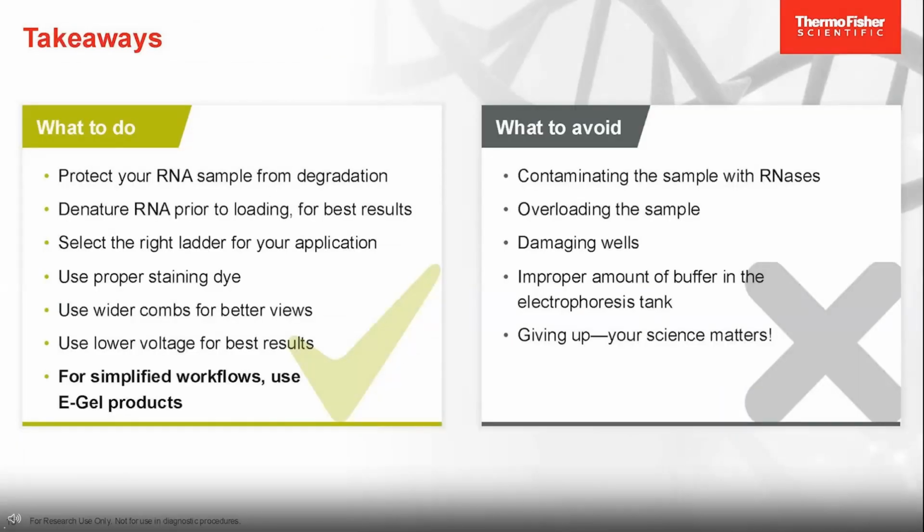Some of the key takeaways here: protect your sample from degradation. I think I made it significantly clear throughout this presentation that this is the key moment. Denature your RNA prior to loading for best results. Make sure that you have the correct size of your fragment when you're analyzing it. You have to select the right ladder for your application to make sure that you size it correctly for your experiment. Use the proper staining dye, because otherwise, if you want to image the gel after your run, you won't be able to see it.